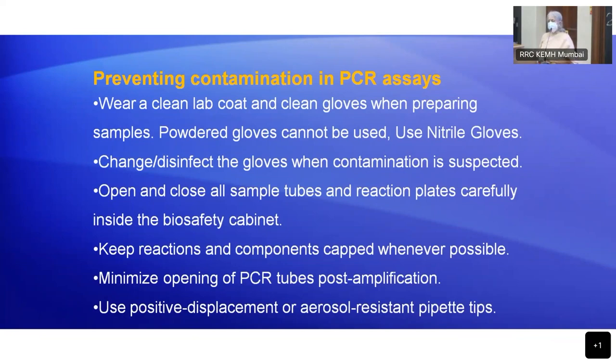Then everything that you want to use in the lab should be done carefully. When I'm preparing a master mix, or when I'm adding template to the plate of master mix, we take everything there, because of the effect on the master mix. So keep it capped, don't keep it open, or shift it from one place to the other. Open it when you have to add to the plate, right?